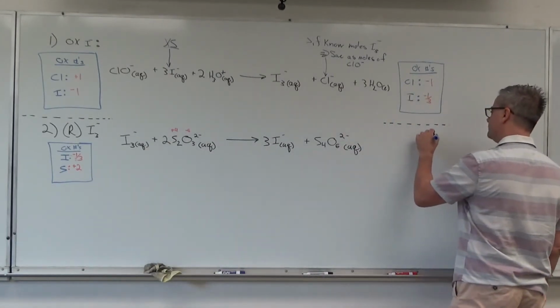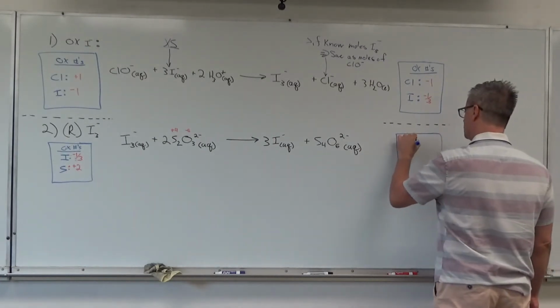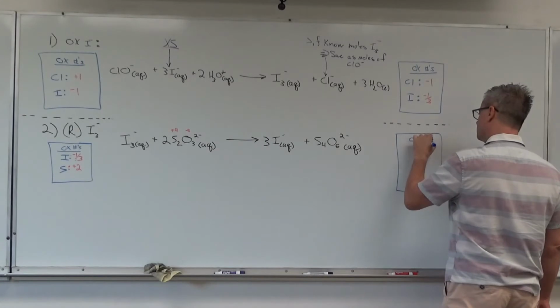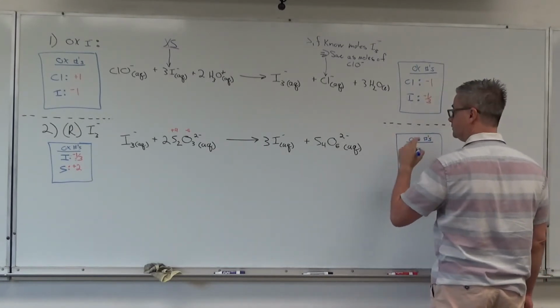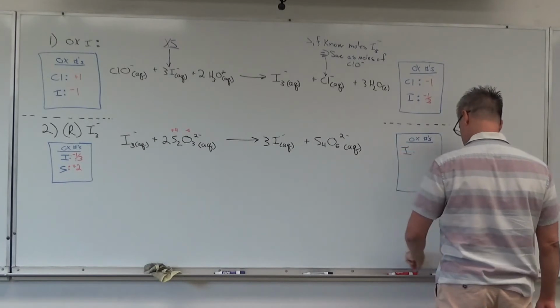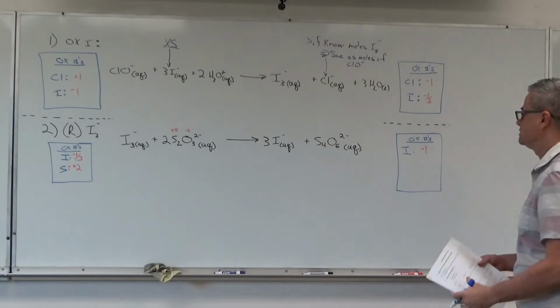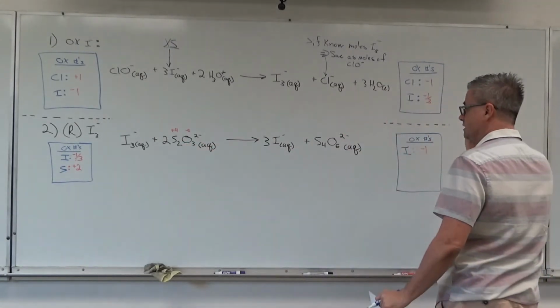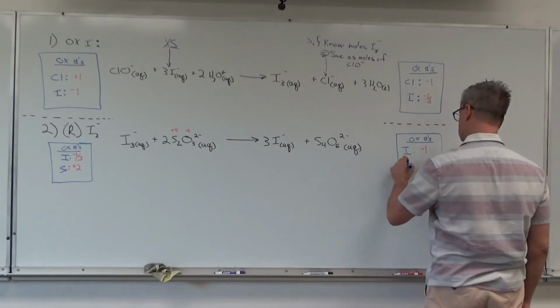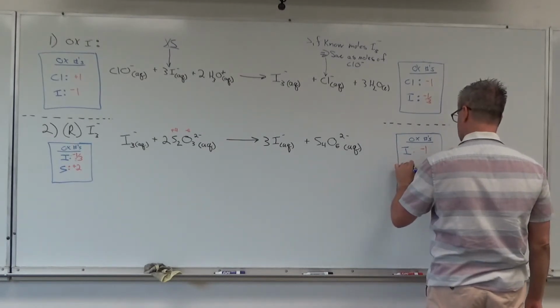Let's see about the product side. We've already done this before for iodide. I-, that's just going to be -1, so it has become more negative. So triiodide was reduced over this process. Now let's see what happened to sulfur. If this goes as expected, it should be oxidized.